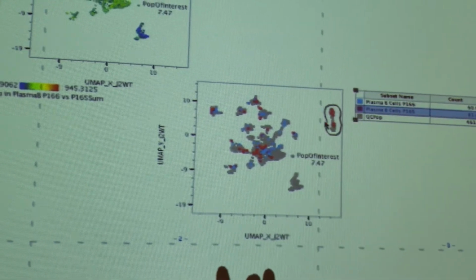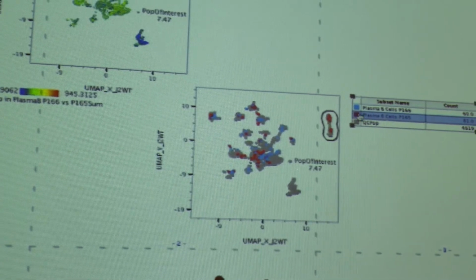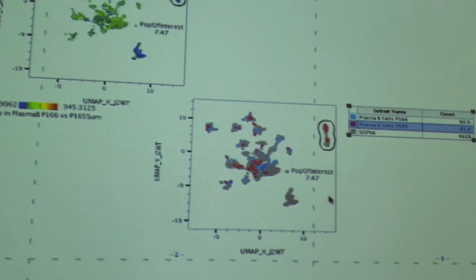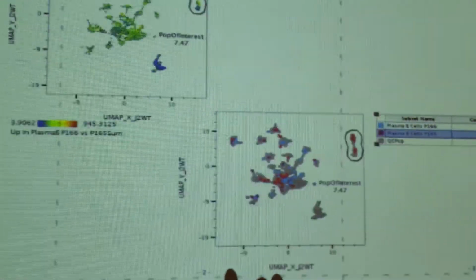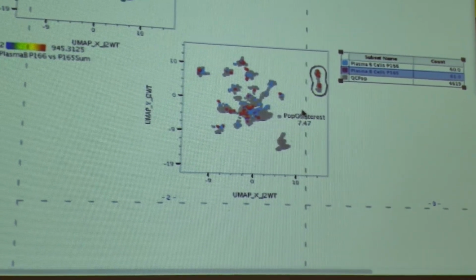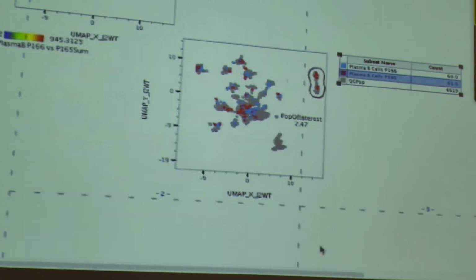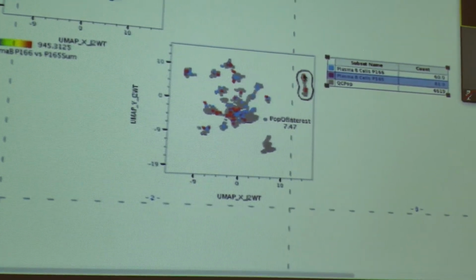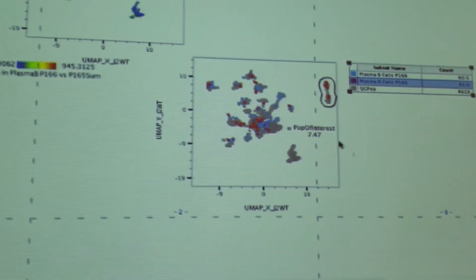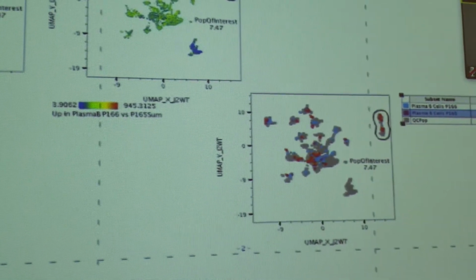Right. But it doesn't really tell us much about those individual cells in terms of their phenotype. We might still think these are plasma B cells. It's a little bit hard to say at that level, we're zoomed way out. Yeah. So these are just populations that are variable according to the UMAP algorithm. And certainly this one to me looks like it could be at least mostly contamination, based just on that color mapping. Now, is UMAP maybe the best way?